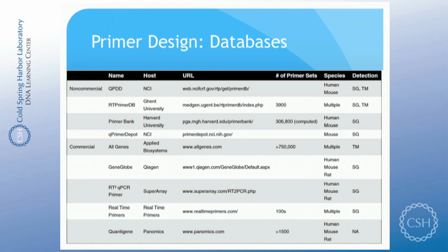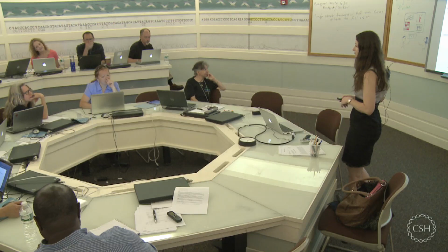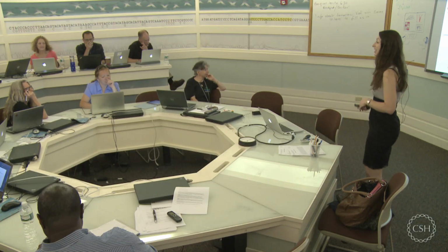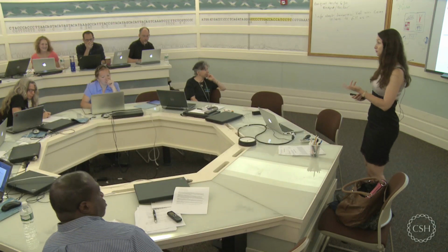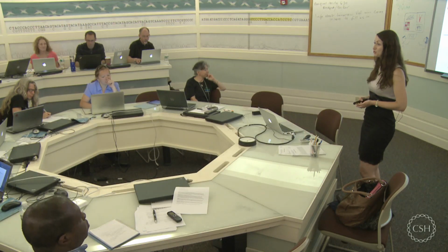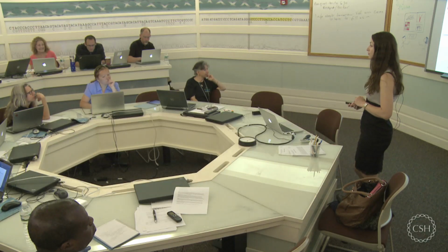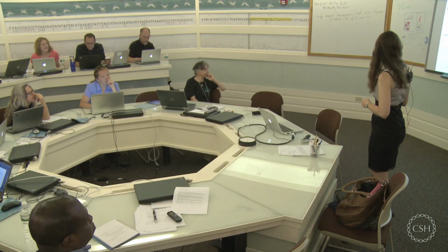So that's not a design database, that's just a database of known primers. Yeah, exactly. But they're all for mouse or human. So that's exactly what I wanted to mention. Most of those public databases are for mouse or human because they're just the most commonly used organisms. Some of them are also for other organisms, but if you are working with something very exotic, you might not be successful with the public databases.